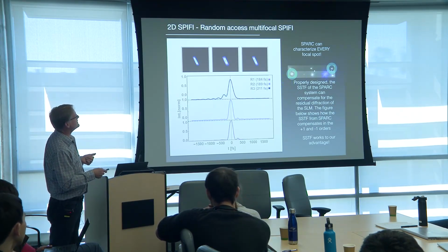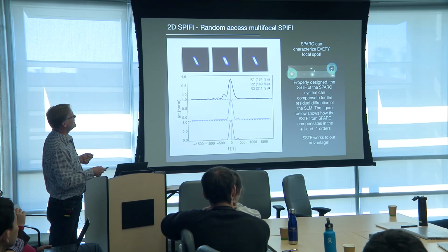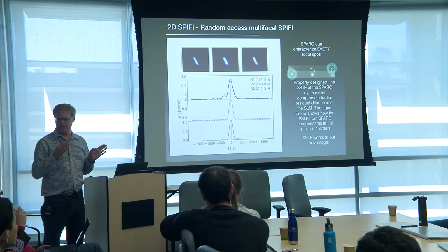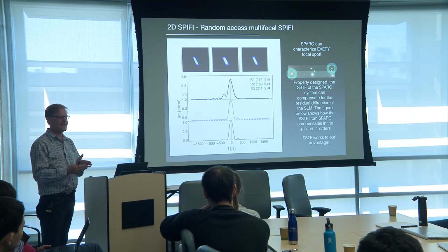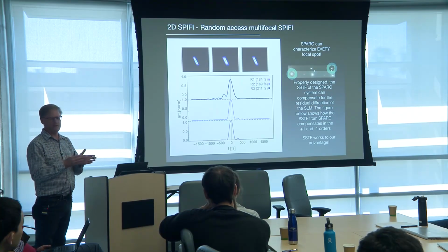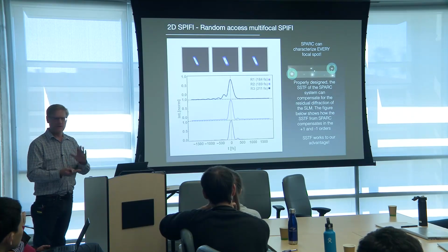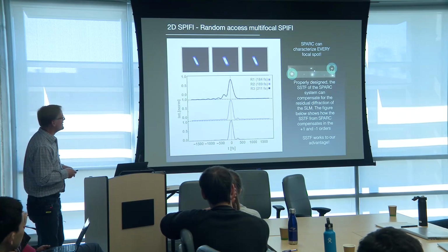And that's what we do here. Initially I had a really bad spot, and I got a good one over here if I rotate the spatial chirp. So it was purely serendipitous that you're picking up bad effects from the SLM that create a spatial chirp. We can correct for it at some level, on average over our field of view, by rotating the spatial chirp from the spark system on top of it.